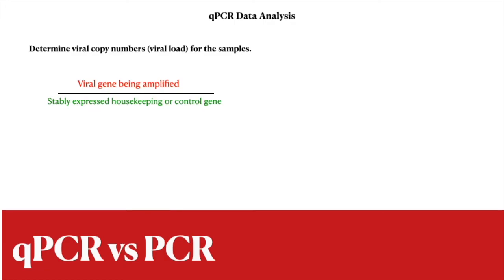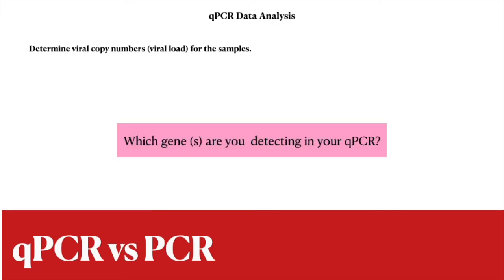Okay, so that's basically the analysis, the parameters that you have to keep in mind when you're analyzing your qPCR. So now over to you, the person watching this video. Which gene are you detecting in your qPCR assay?